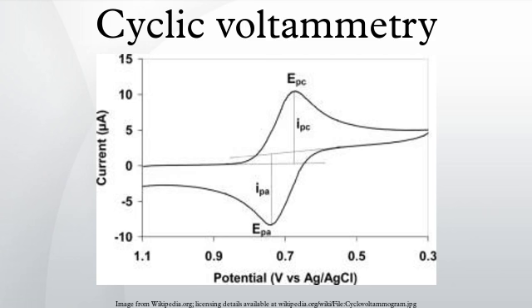Hops, the flowers used in making beer, contain antioxidant properties due to the presence of flavonoids and other polyphenolic compounds. In this cyclic voltammetry experiment, the working electrode voltage was determined using a ferrocenium-ferrocene reference electrode. By comparing different hop extract samples, it was observed that the sample containing polyphenols that were oxidized at less positive potentials proved to have better antioxidant capacity.